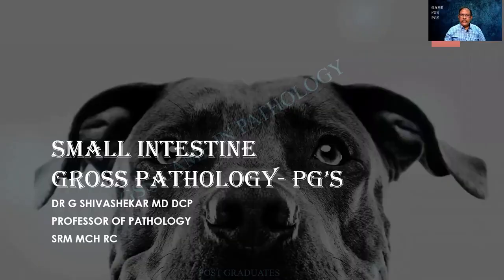My dear postgraduate students, we shall continue with our experiments on the gross pathology of various organs. And the class for the day is small intestine. Small intestine is a little tricky, in which it traverses many an organ or an organ system pathology, and the questions can go in any direction.